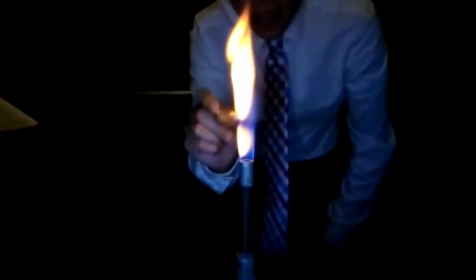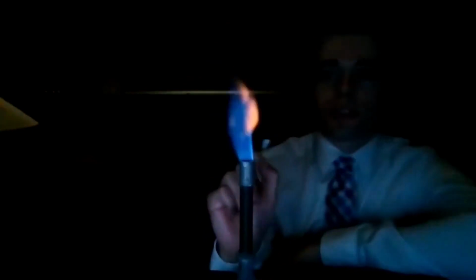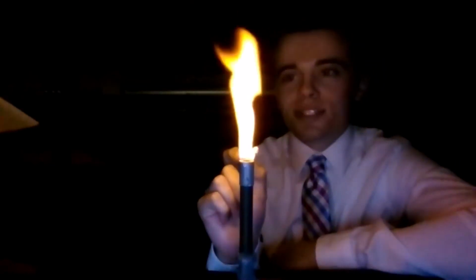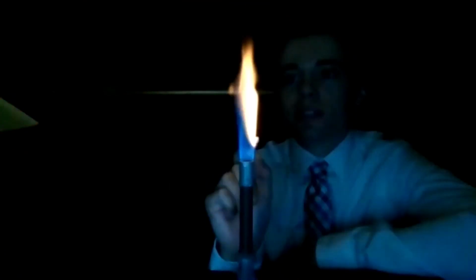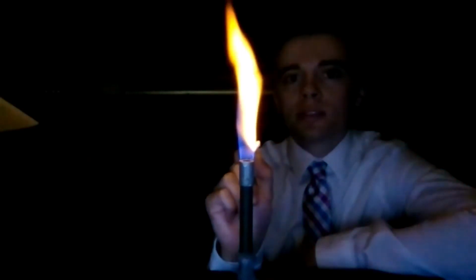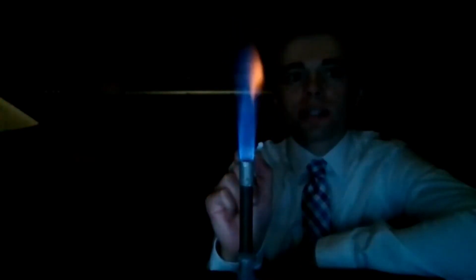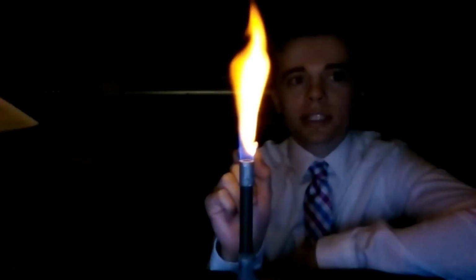What color would you say that is? It looks orange from my perspective. Orange. Yeah, it's totally orange. So in this case, the camera's not lying to you. It is actually a nice, solid orange flame. Actually, if you see the very tip of it in the camera, that's actually what the entire flame looks like.